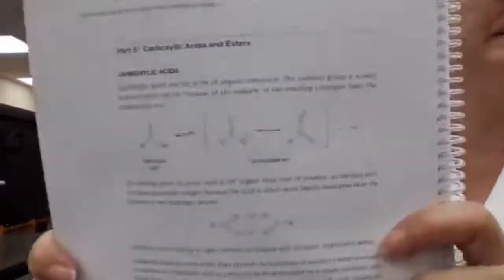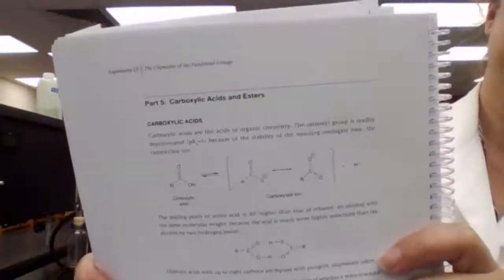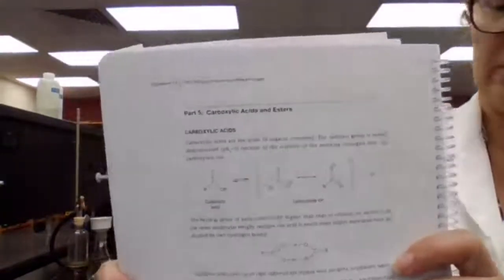Carboxylic acid. How do you know you have a carboxylic acid based on solubility test?